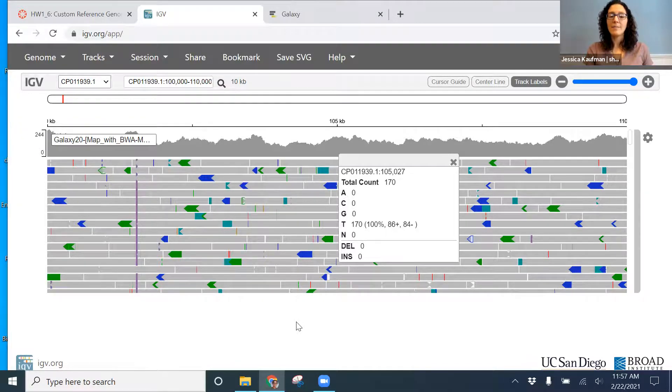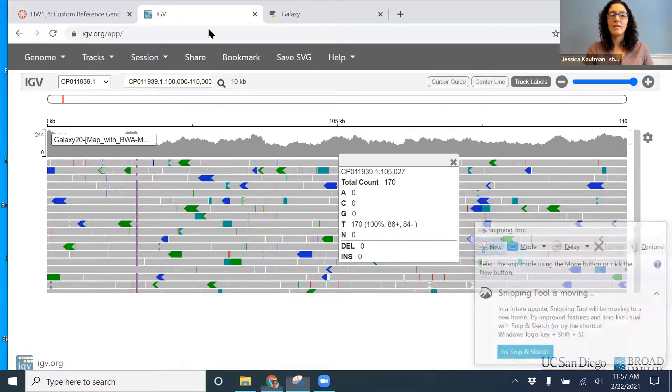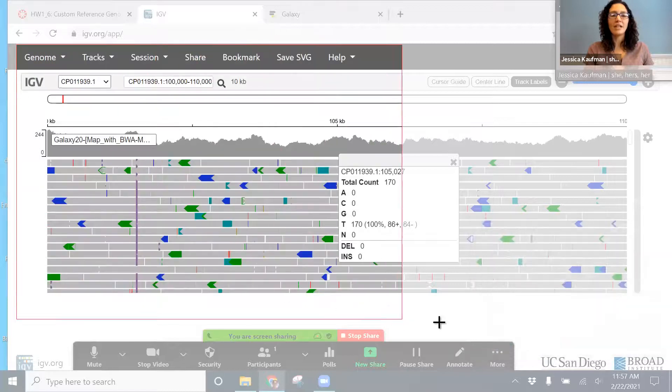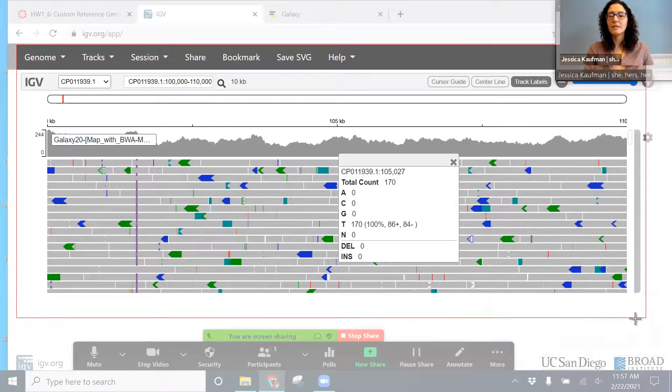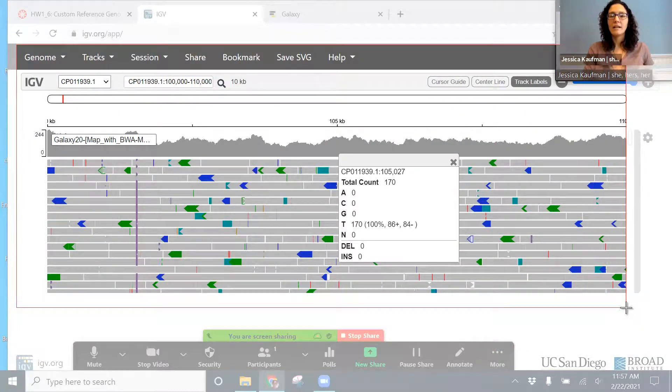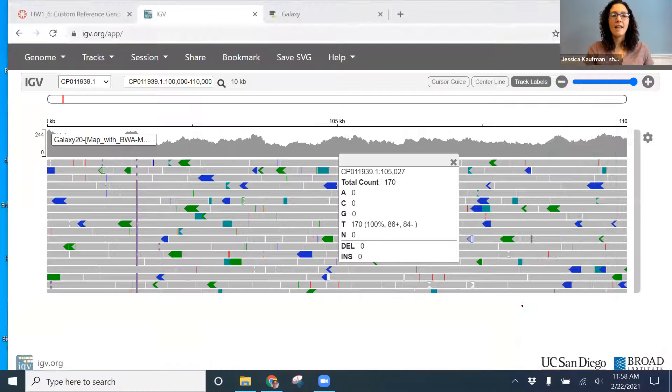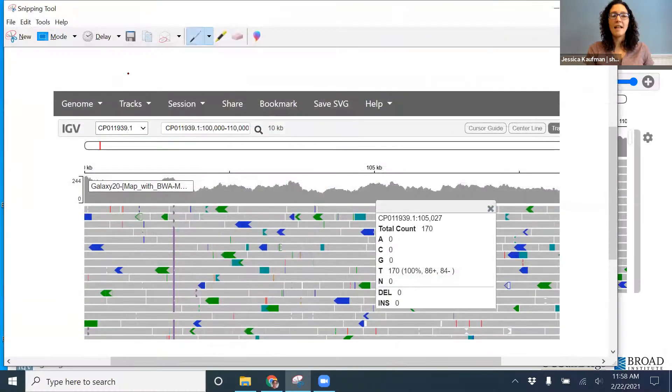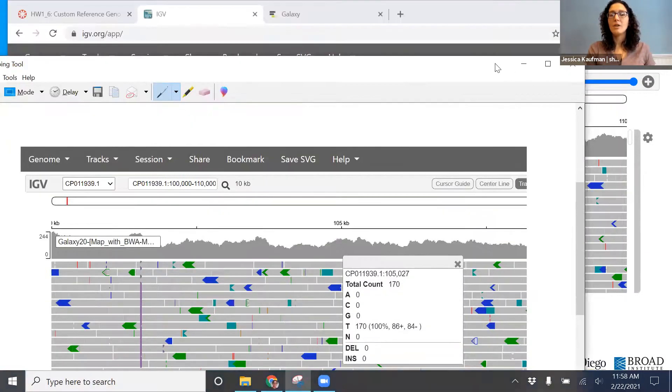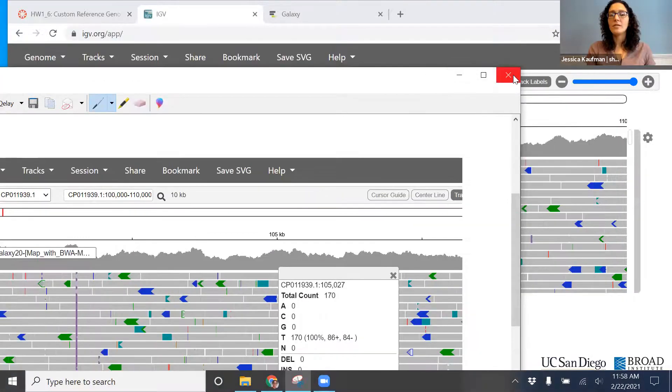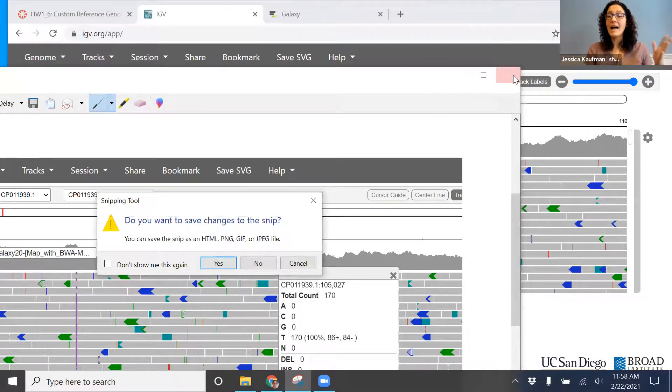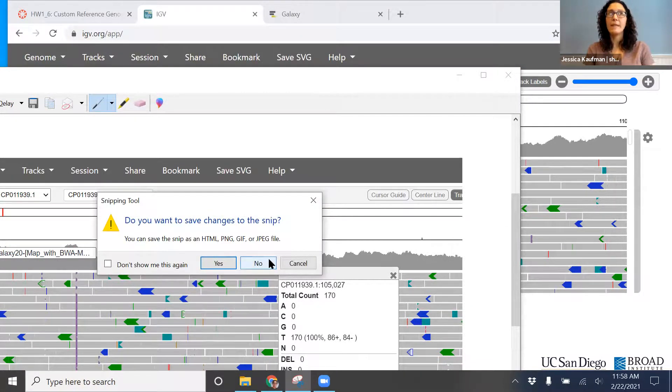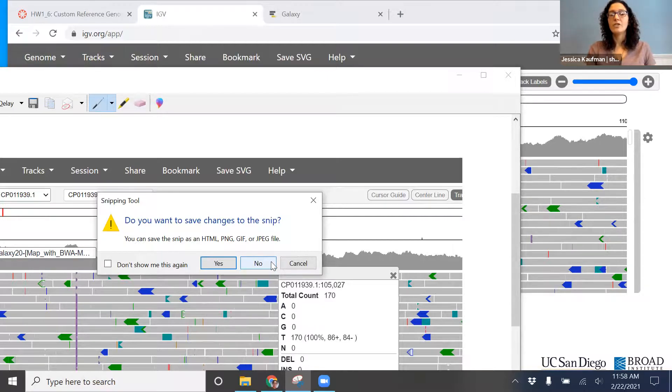Now I can use the snipping tool to take a picture that I can use as a figure and save it to my desktop. You can also use, on a Mac, shift alt 3 or command alt 3 or alt 4 to do a screenshot.